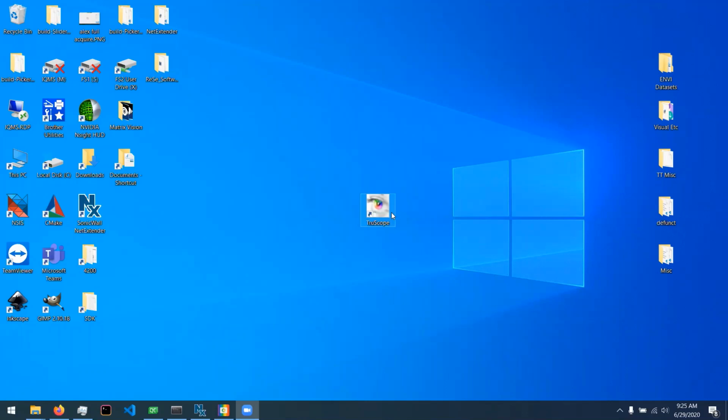This is a short tour of the Hinalea Imaging 4200 Truscope application software for the Windows 10 operating system. The Windows 10 version should be very familiar for users of our Linux version. The application is easily installed and can be launched from the Truscope icon on your desktop. The application starts in the Acquire page.